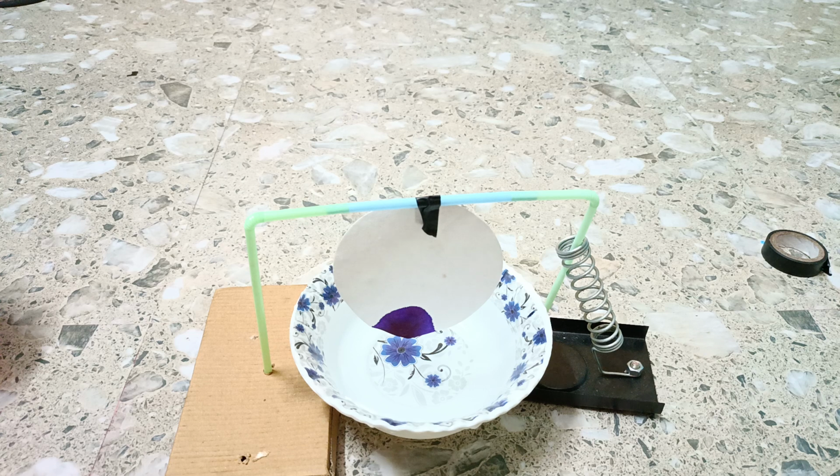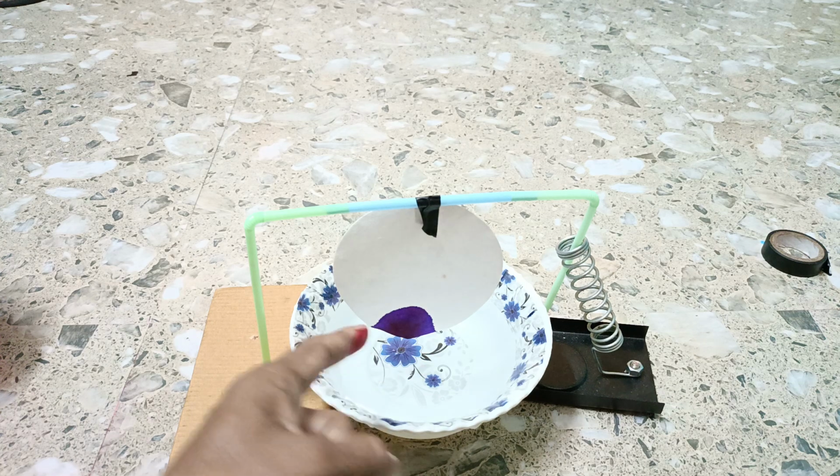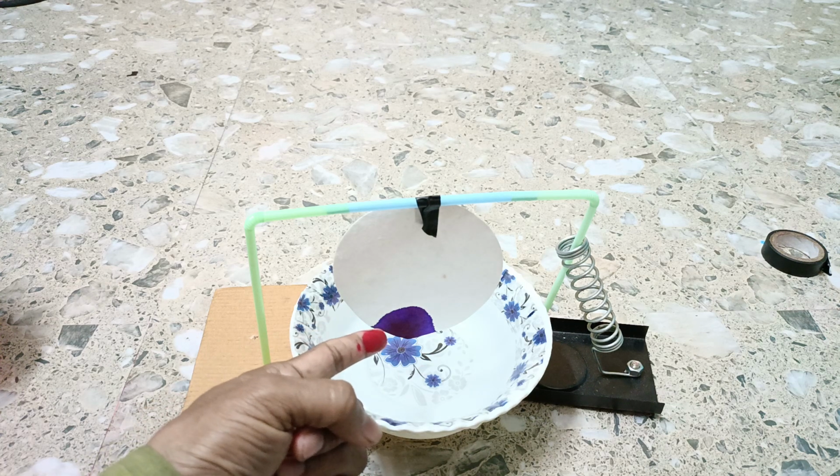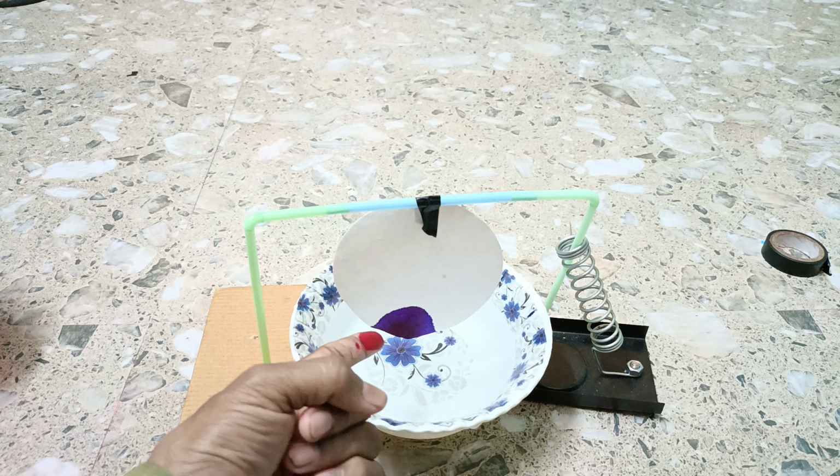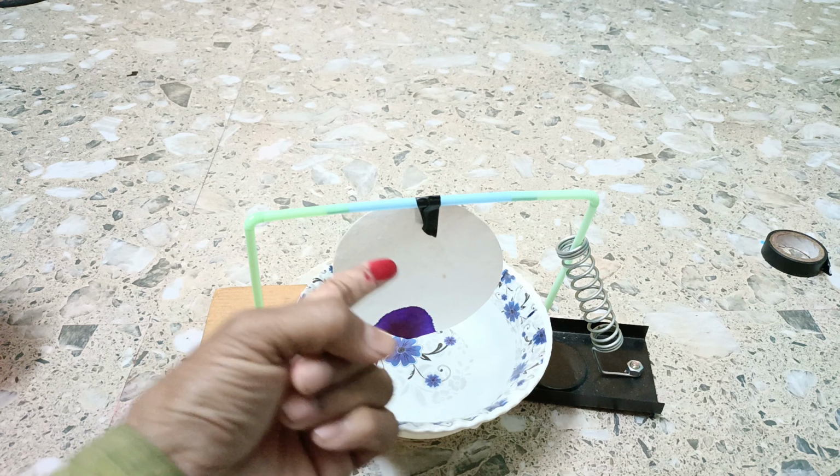The question is, what is chromatography? In a paper chromatography experiment, a small amount of a sample solution is placed on a strip of chromatography paper or filter paper. The chromatography paper is then suspended in a solvent. As the solvent moves up the paper, the individual components of the sample solution separate out in bands of individual color. That means here you can see that there are two colors, one is blue and the other one is red. If we put water here, as the water moves up, the two colors will be separated in two positions.